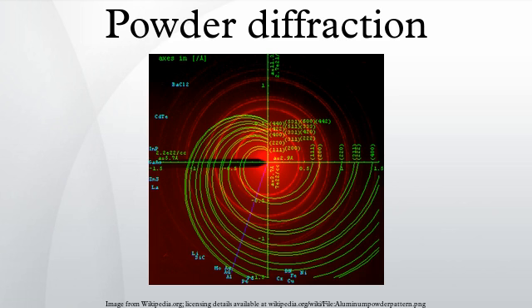Since all possible crystal orientations are measured simultaneously, collection times can be quite short even for small and weakly scattering samples. This is not merely convenient, but can be essential for samples which are unstable either inherently or under X-ray or neutron bombardment, or for time-resolved studies. For the latter it is desirable to have a strong radiation source. The advent of synchrotron radiation and modern neutron sources has therefore done much to revitalize the powder diffraction field because it is now possible to study temperature-dependent changes, reaction kinetics and so forth by means of time-resolved powder diffraction.